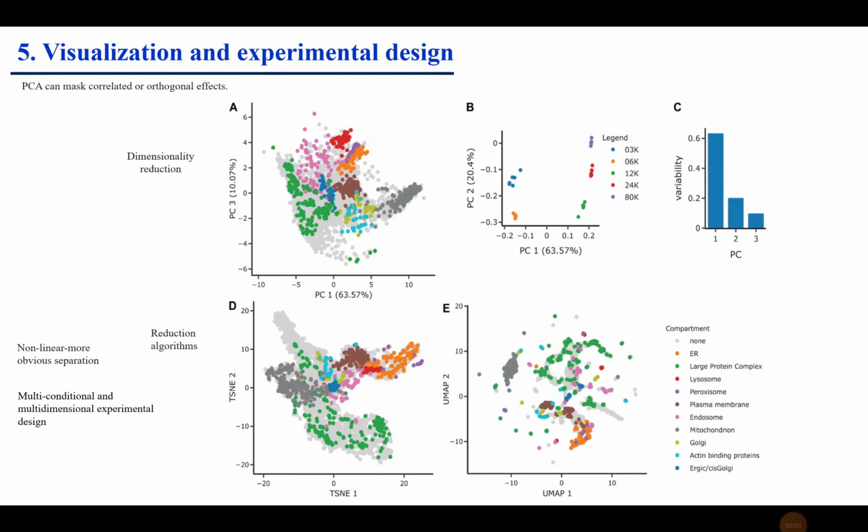Previously, we dealt with a simple example where the number of treatments was only two. But what about when the number of treatments is more than two and involves a complex design? You have often seen this type of PCA analysis in different complex experimental designs. It is important to note why we use PCA analysis: we use it for dimensionality reduction. How can we understand this?